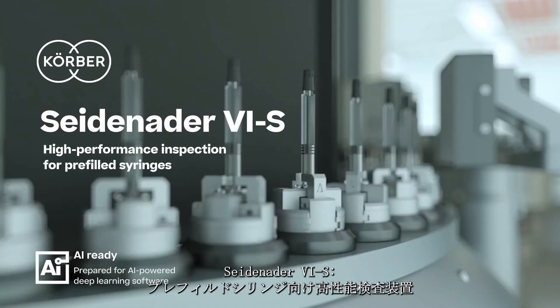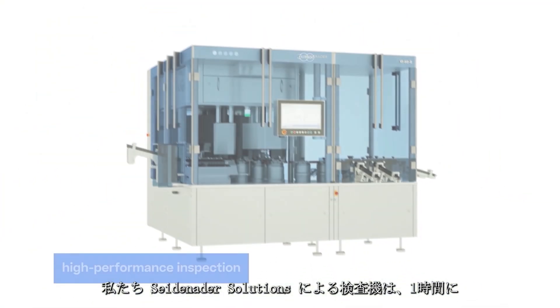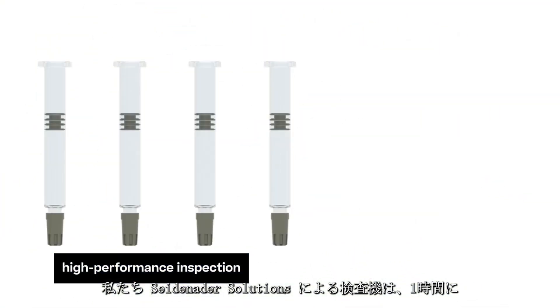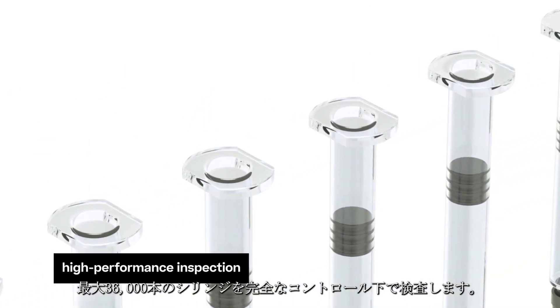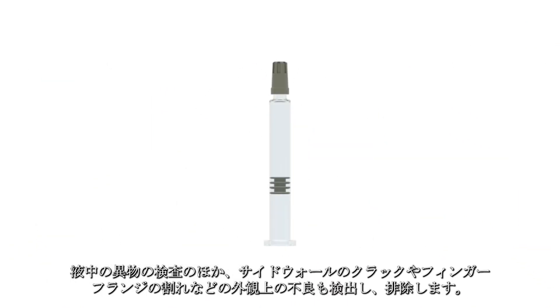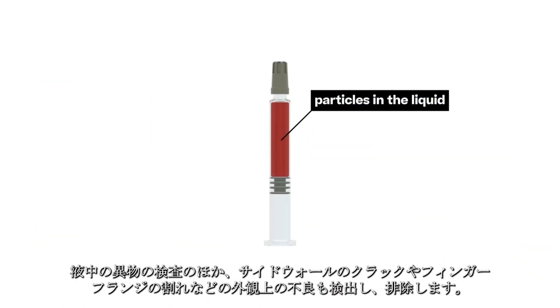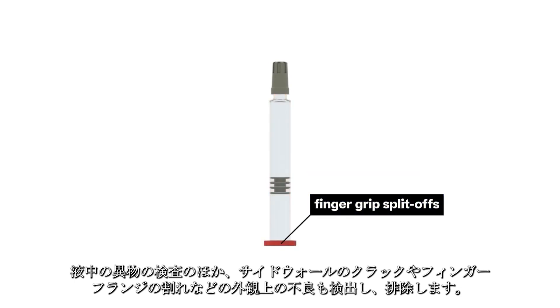Seidenader VIS – High Performance Inspection for Pre-filled Syringes. Our inspection machines by Seidenader Solutions provide 100% control at a speed of up to 36,000 syringes per hour. Besides the inspection for particles in the liquid, cosmetic defects like sidewall cracks or finger grip split-offs are detected and rejected.